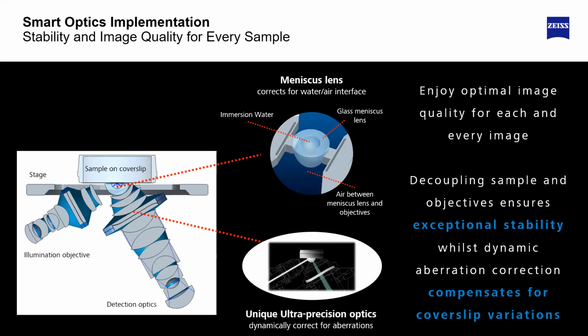Exactly. So it's not necessarily going to be a very... I don't want to say reproducible because it's absolutely reproducible, but it is look at it, find your best image, and then go with it. You don't have to take calipers to your cover slip and figure out how thick it is. You just change a slider, see where your image is really coming through the crispest, and then move on. It's really quite simple to implement.